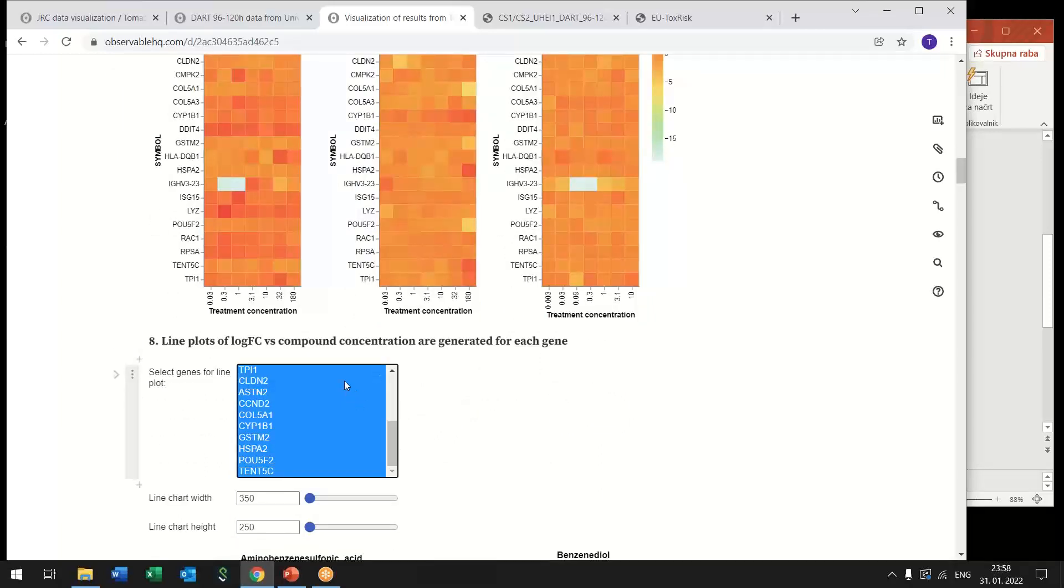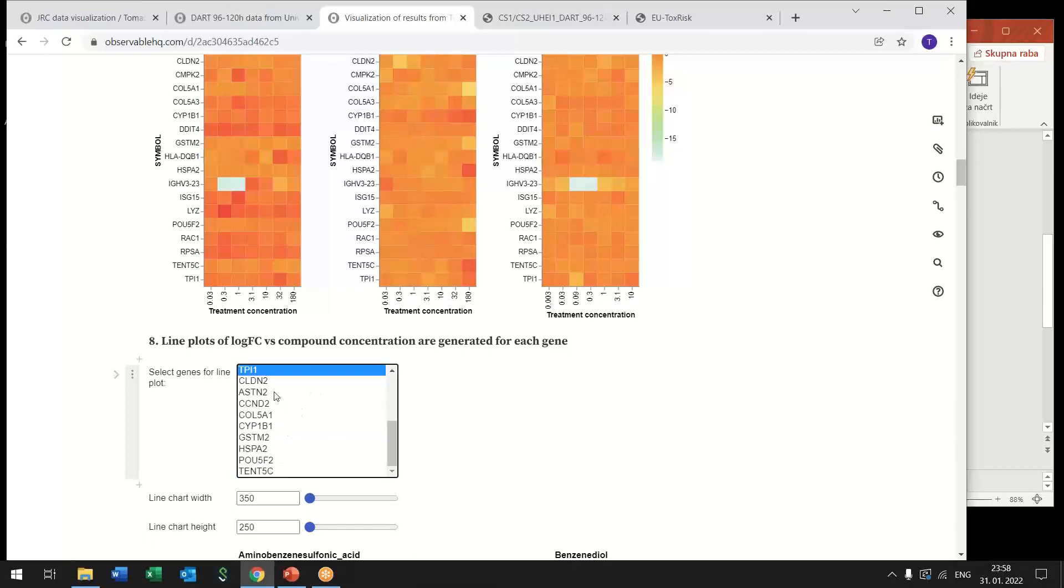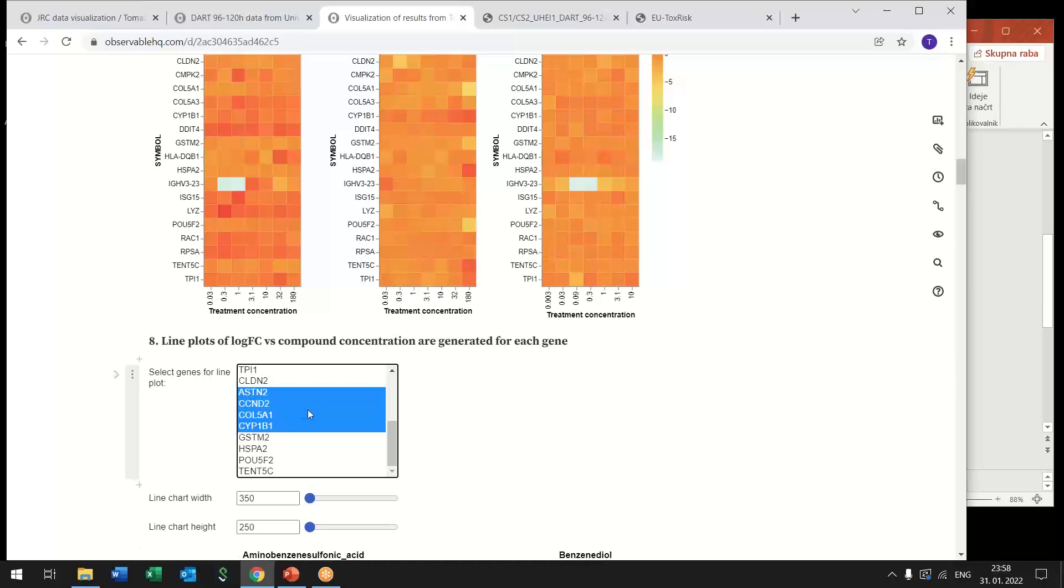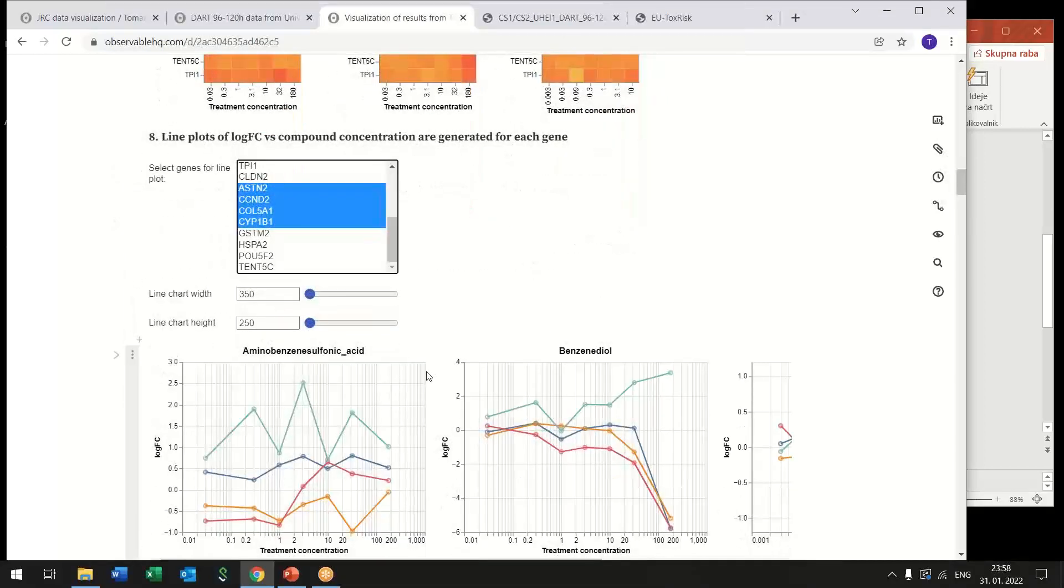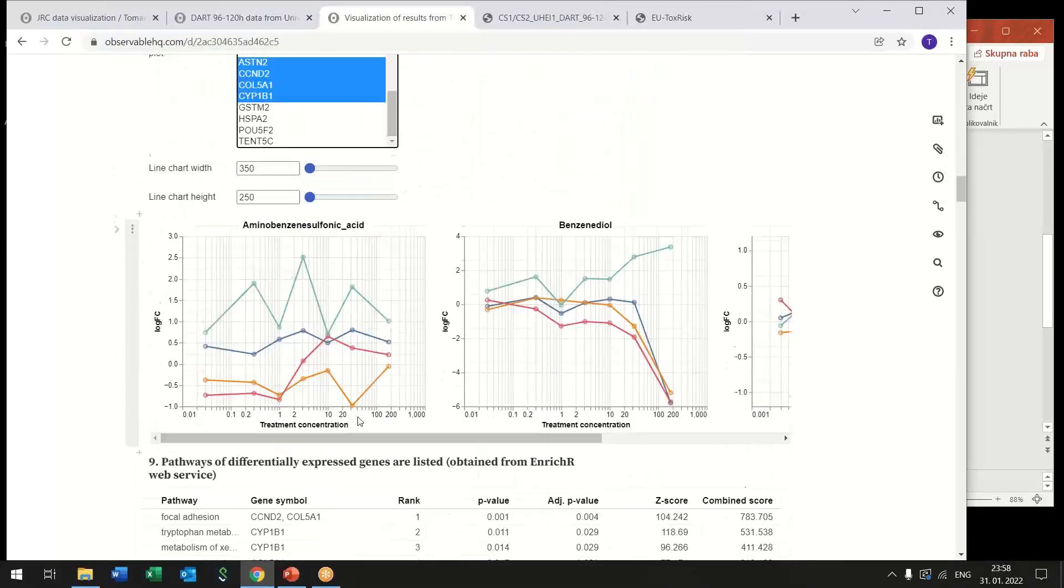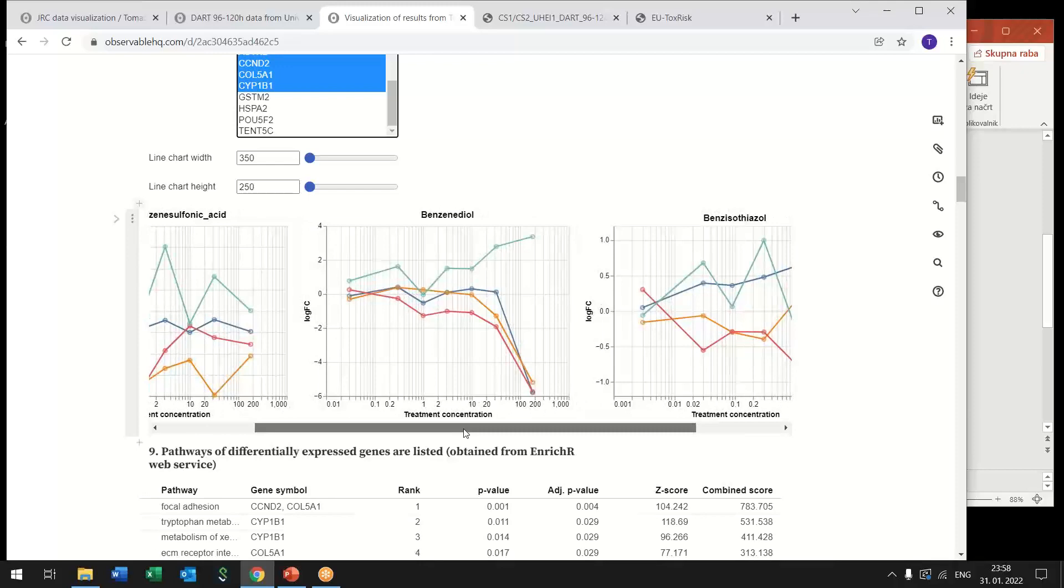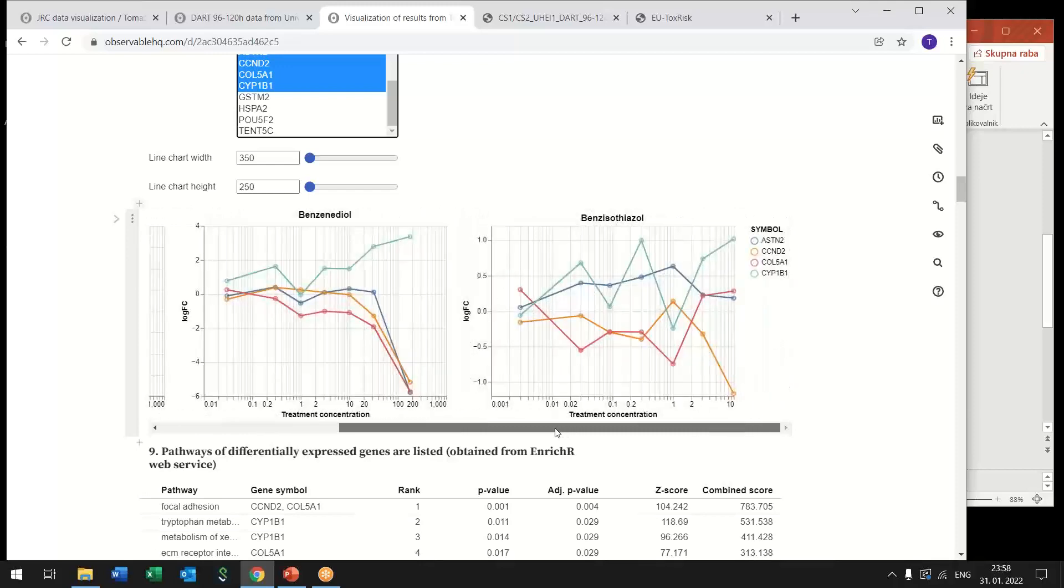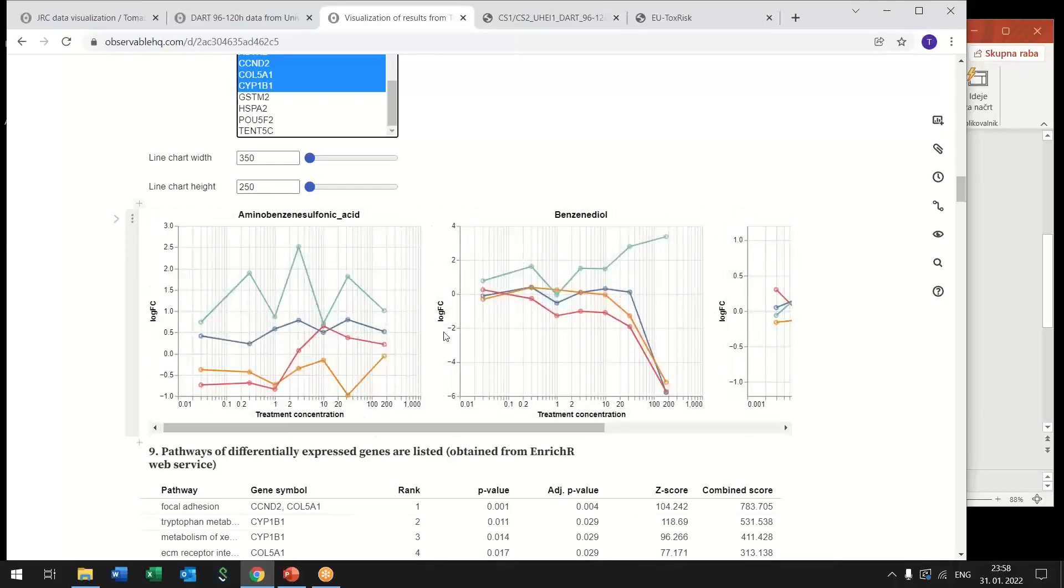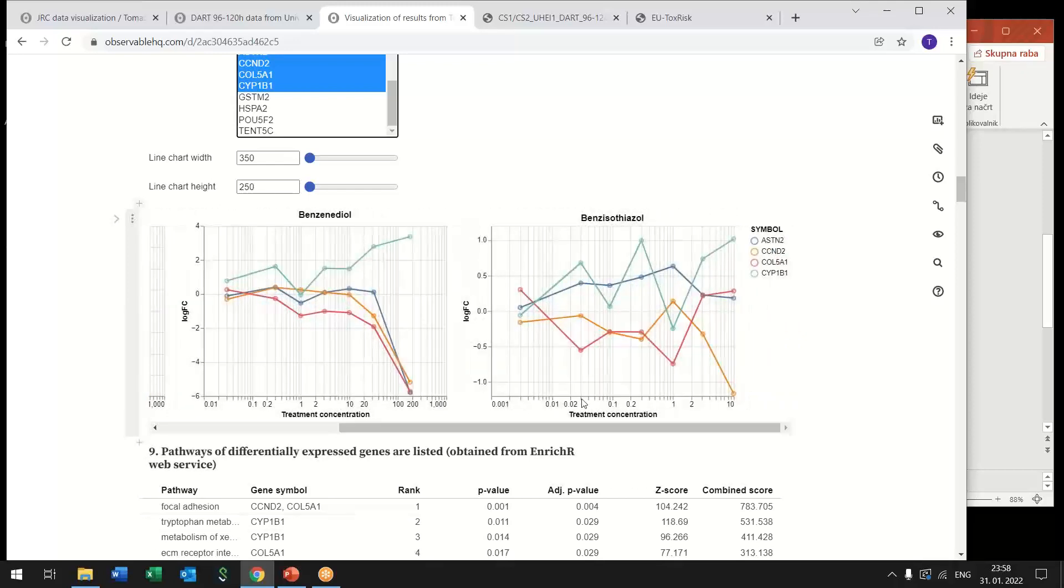Then for a subset of these genes you can also draw a line plot so we can select maybe four genes that we are most interested in and here we get line charts for the three compounds and for each of these the gene expression, the fold changes for these four genes are displayed.